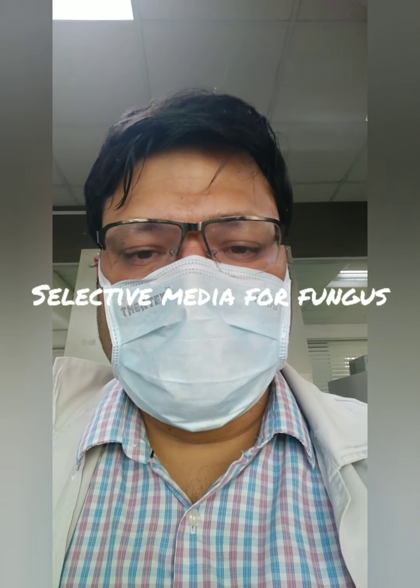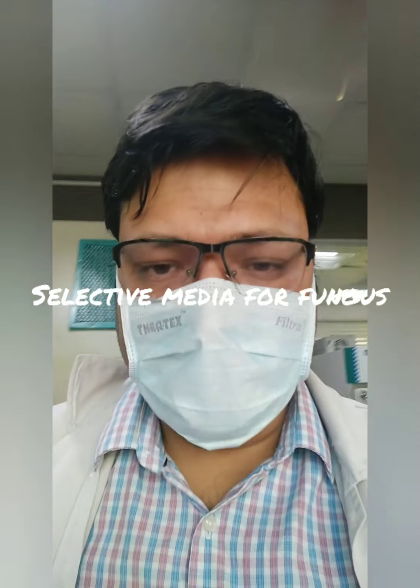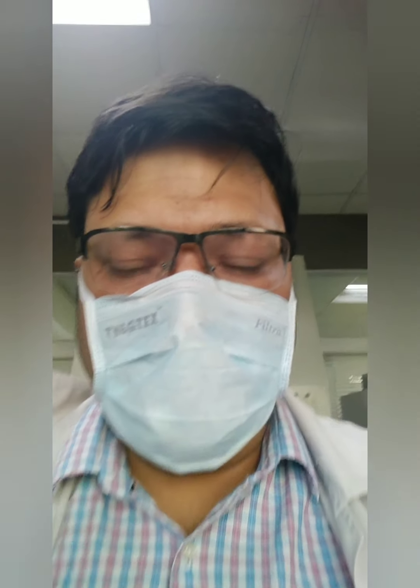This media is a selective media for the cultivation of fungus. Selective media means it does not allow the growth of bacteria in it.